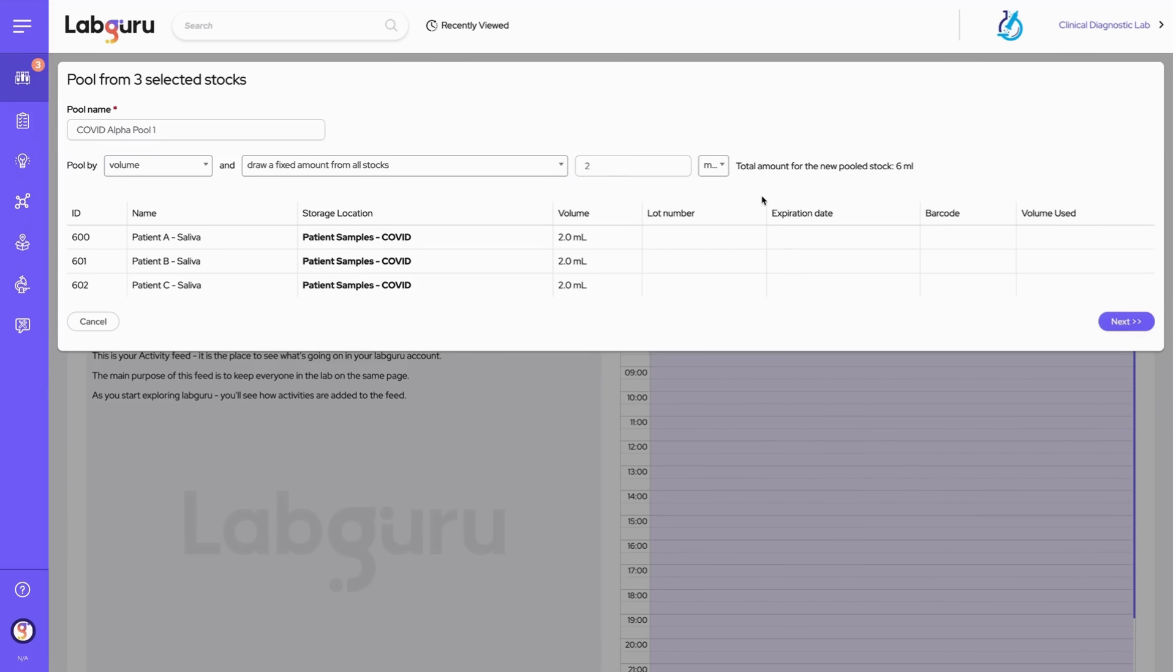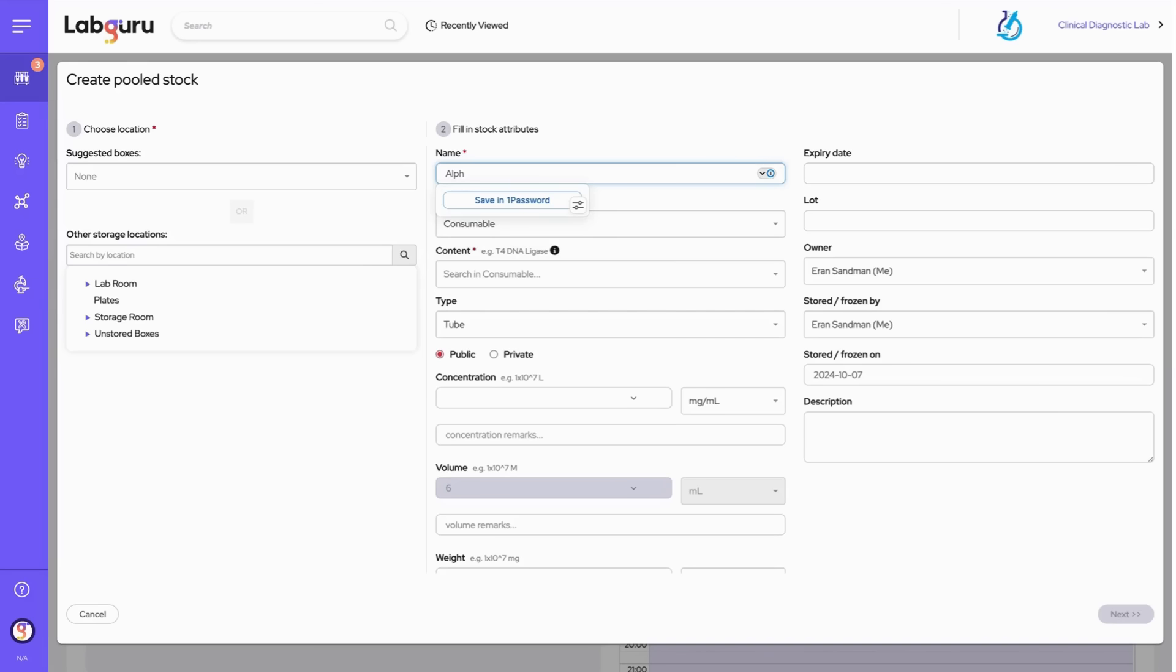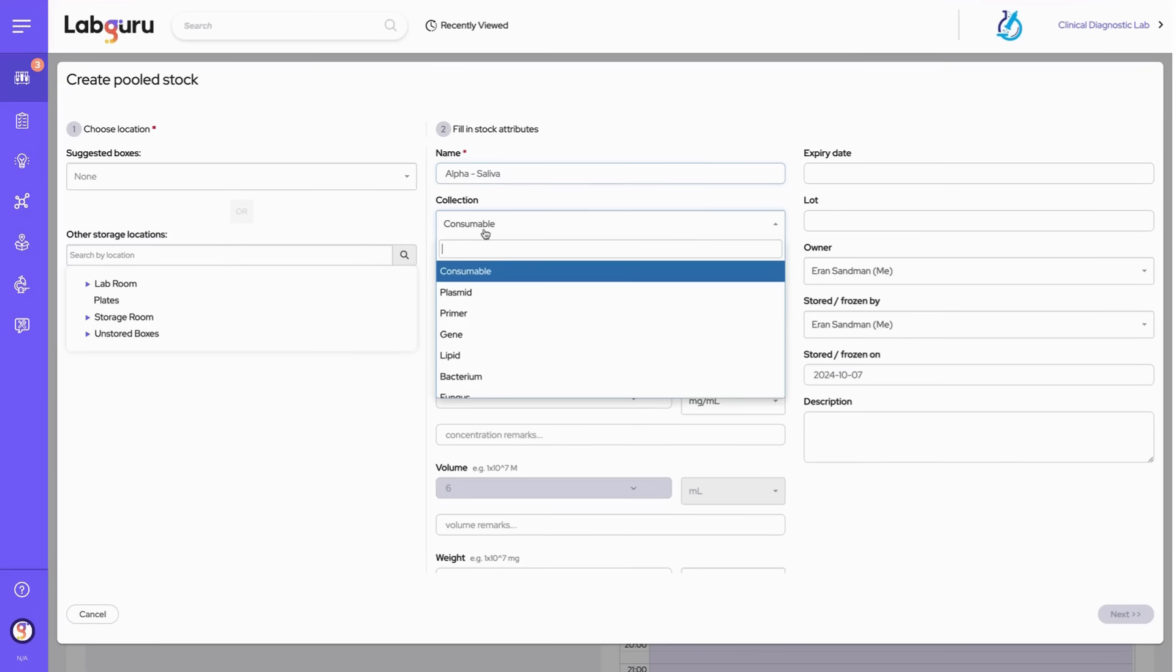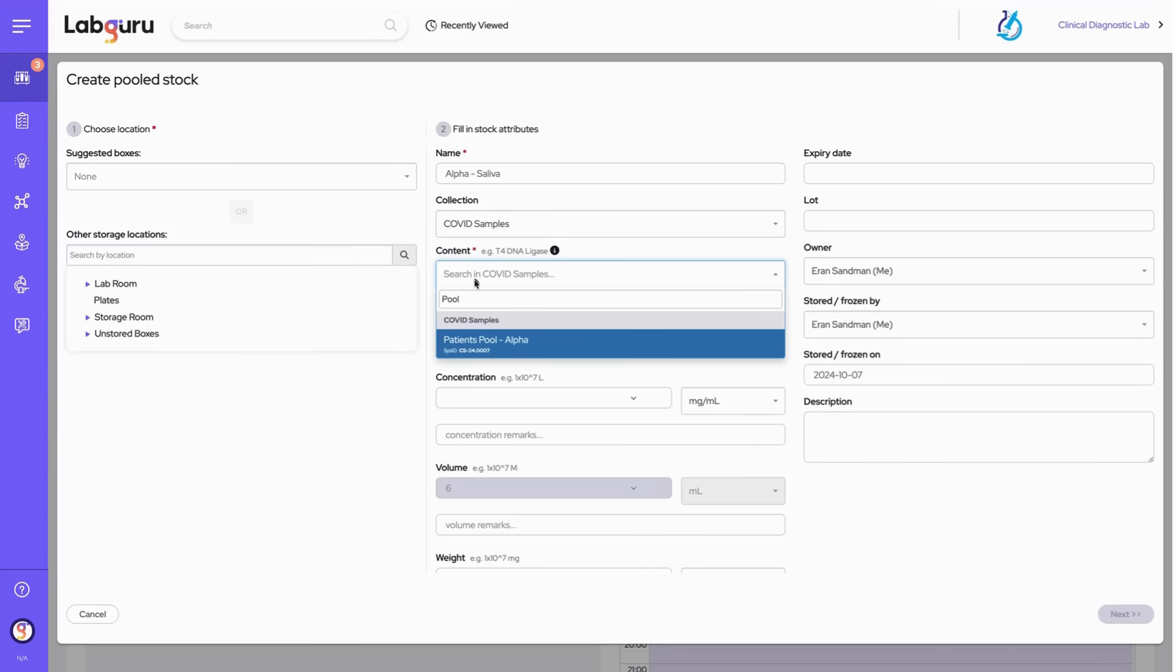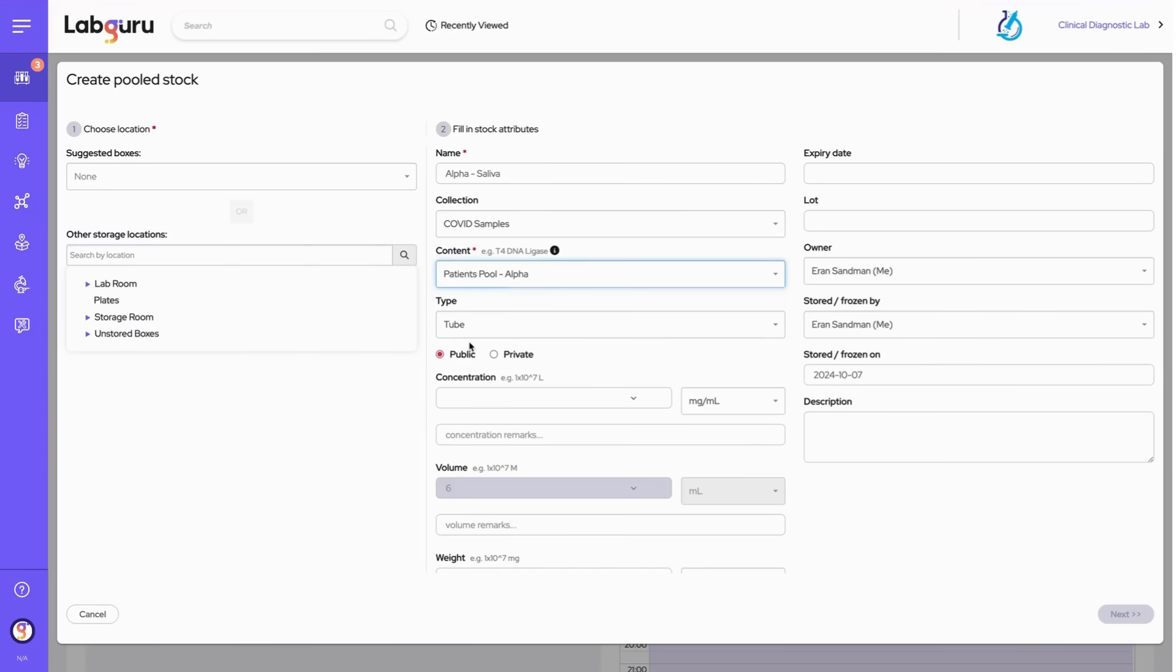Next, we create the pooled stock by selecting the collection item it will belong to. Notice that the six milliliter volume is locked in and cannot be changed. Finally, we assign the pooled stock to a designated storage location to complete the process.